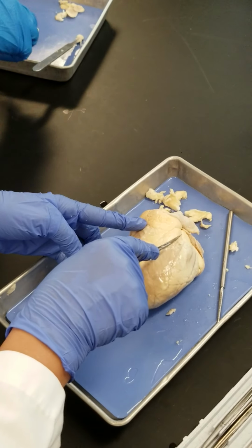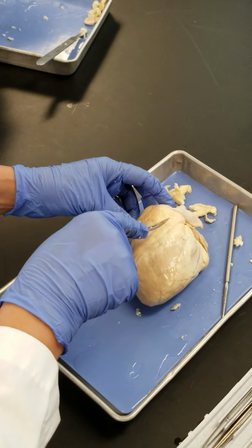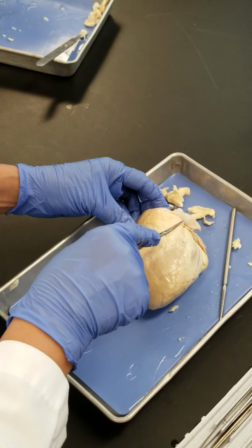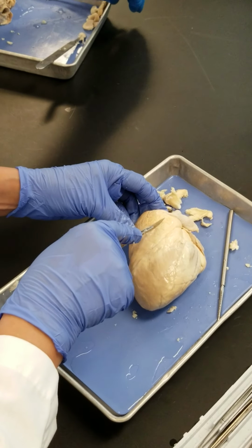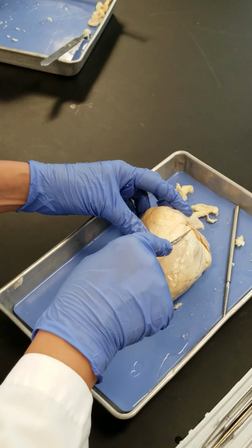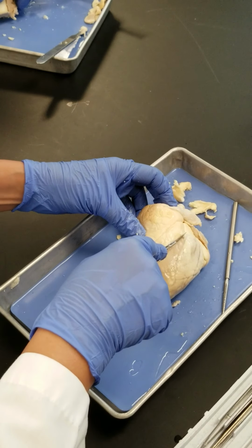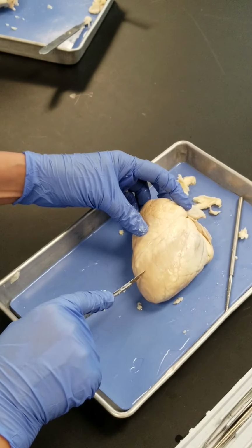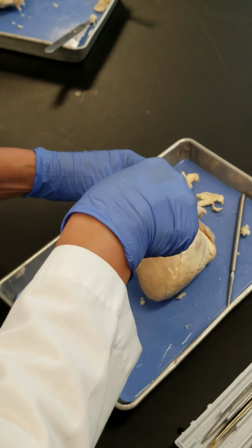So we can go to, let's say, the right side of that, okay? We go just parallel, close to this one, but not very close. Maybe go to the left side, about half an inch toward the left side, and go parallel to the interventricular sulcus, right?